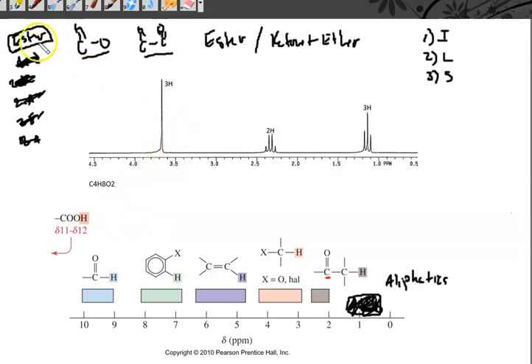But I'll make sure you guys understand how I'm even coming up with that. All right, I'm looking to see what my groups are, and that helps me analyze these. So let's start here. I've got something with 3 hydrogens on it, and it's attached to the thing that's the most electronegative, because we're way up at 3.5, so we're right around here. So we're looking at a group like this, which means the oxygen has to be attached there. That's what that fragment tells me.